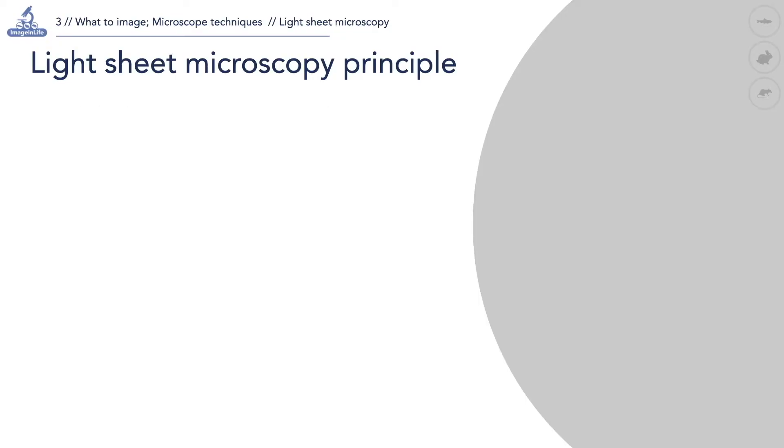Welcome to the Imaging Live course subsection dedicated to light sheet microscopy. I will tell you about the basic principles of light sheet microscopy and how to mount samples on this microscope for specific biological applications.